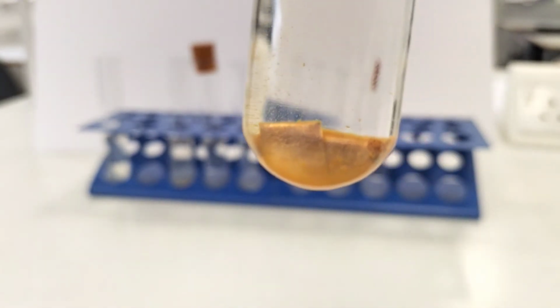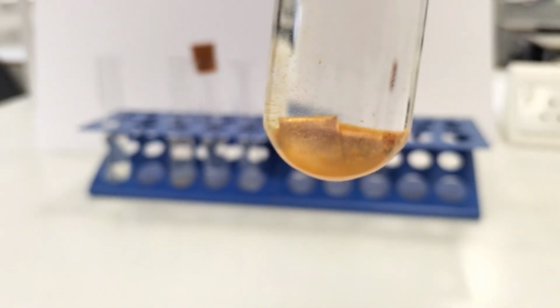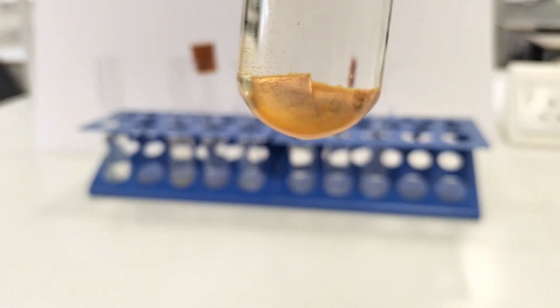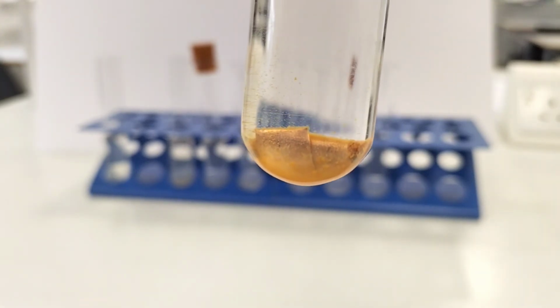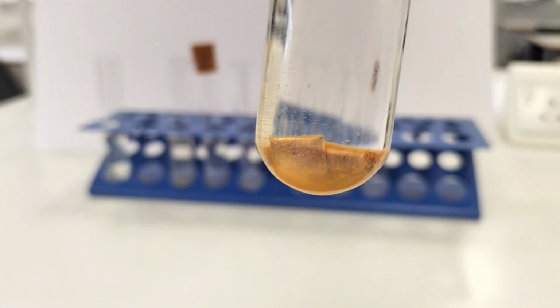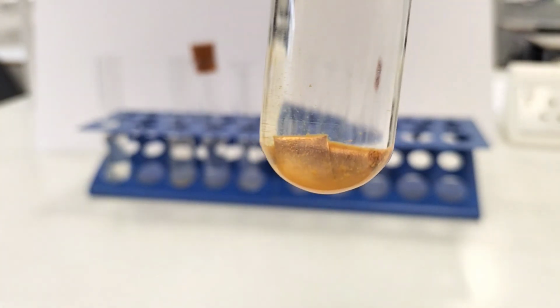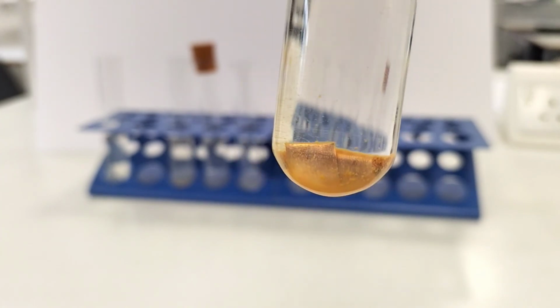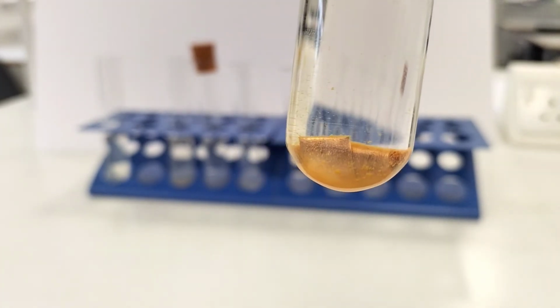The iron is preferentially oxidizing, is rusting faster to try and protect the copper surrounding it from oxidation. And so it's having a counterproductive effect, and actually by wrapping copper around our iron, we've made things worse and made the rusting even more prevalent. So that may have been the wrong choice.